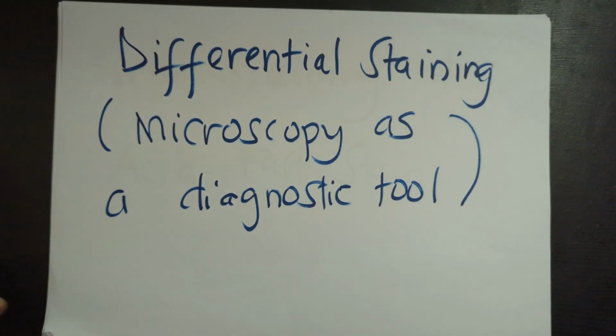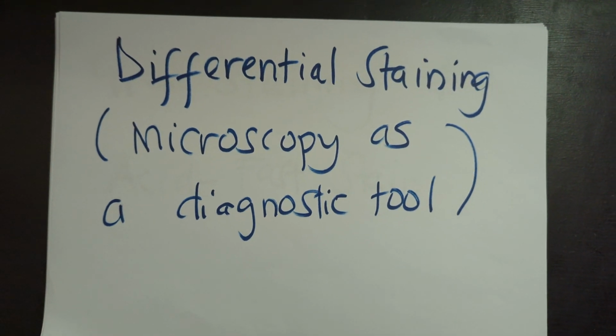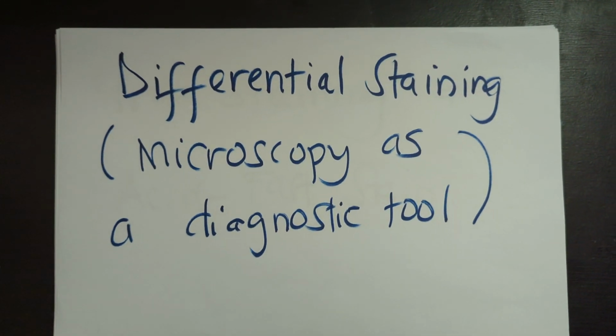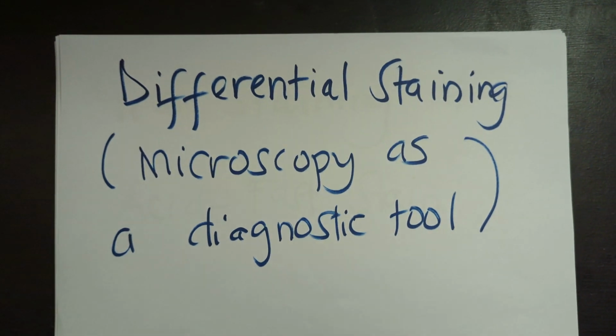Hello, this is a video on differential staining. This is under the topic of microscopy as a diagnostic tool. In your lab manual, it's not titled differential staining, it's titled gram staining.